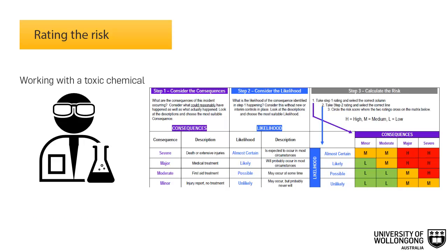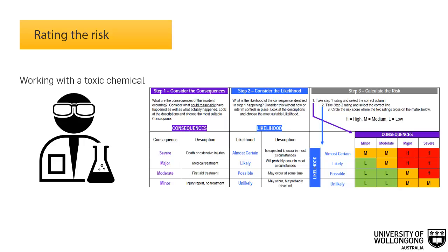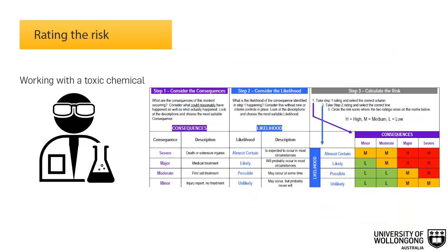Let's work out the level of risk for working with a toxic chemical, using methanol as an example. Consider the consequences of working with methanol — when working with chemicals, you need to refer to the safety data sheet, which will provide information about the hazards including any possible injuries or illness that could occur. Methanol is toxic via inhalation, skin contact, and ingestion, and can cause permanent damage to organs and the nervous system. Therefore, the consequence of coming into contact with methanol could be severe.